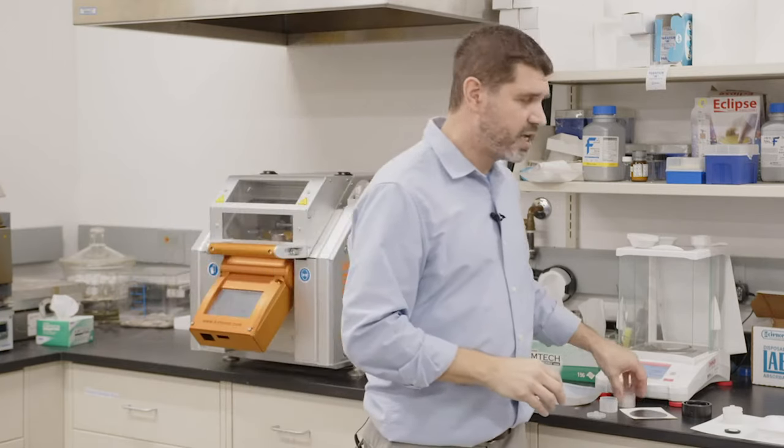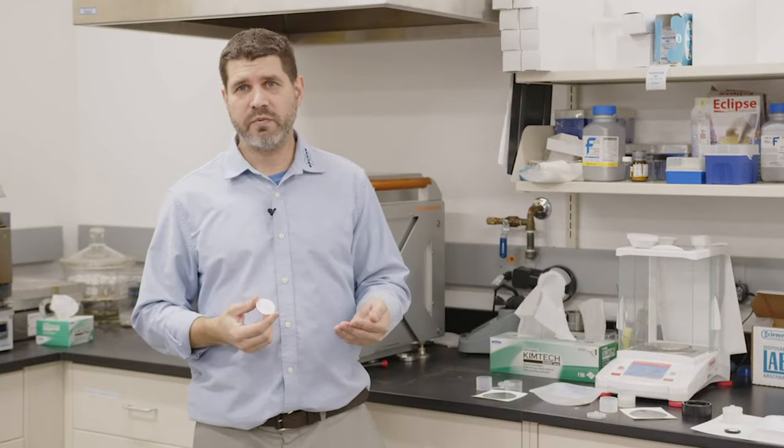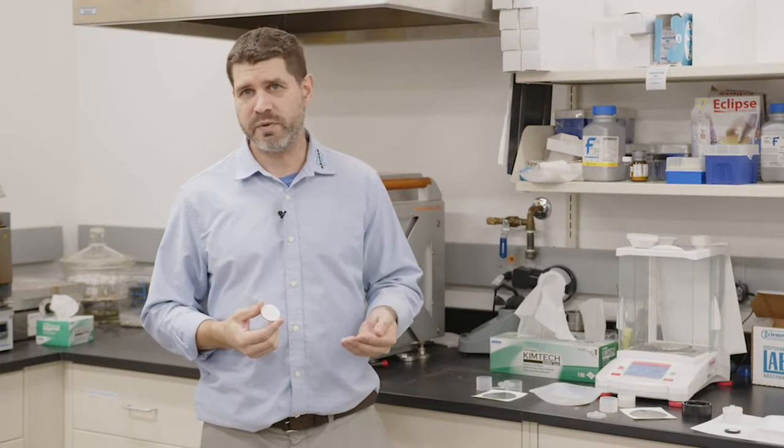Now, if you want to step it up, we can. We can grind the sample, and when we grind it, we use a grinding vessel that's made of hardened steel or tungsten carbide, and we add a binder material to it.